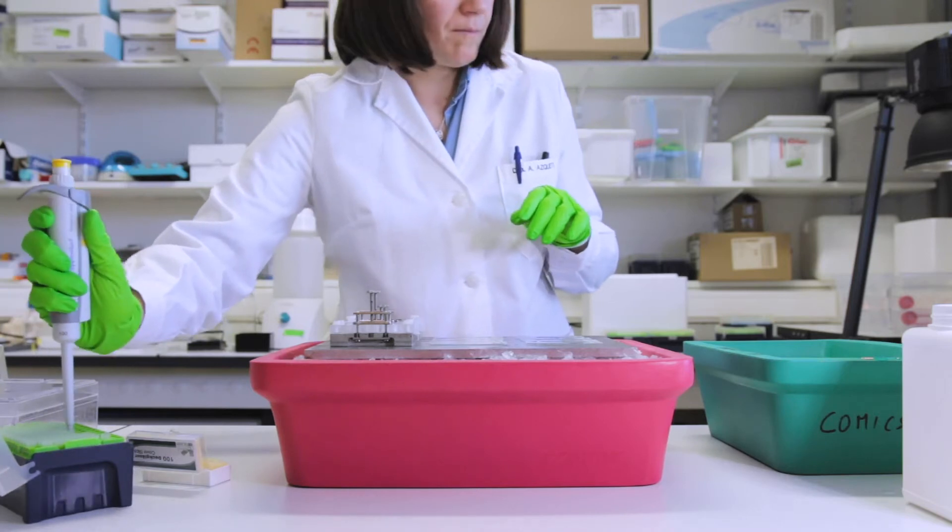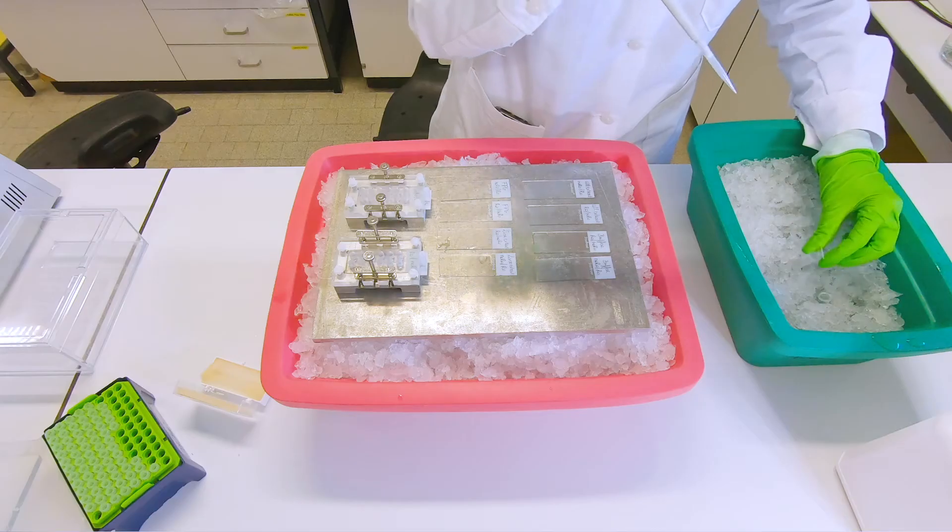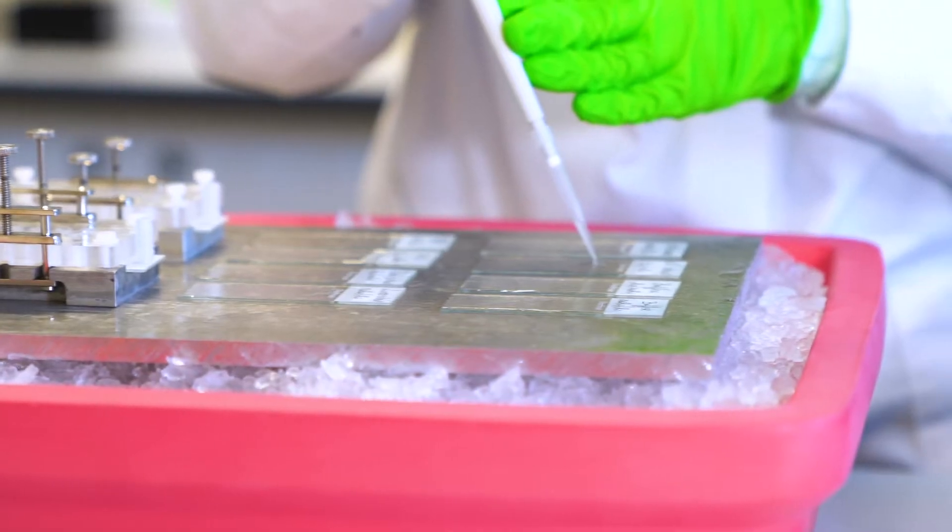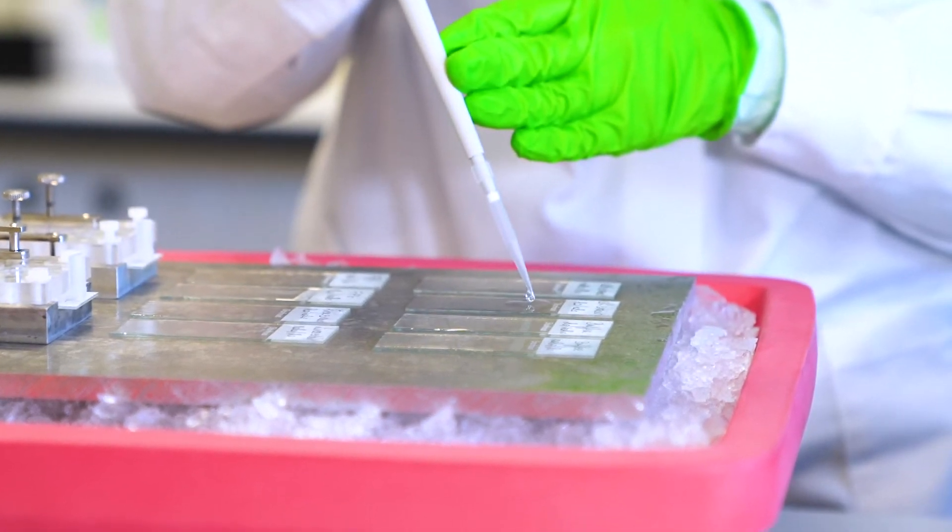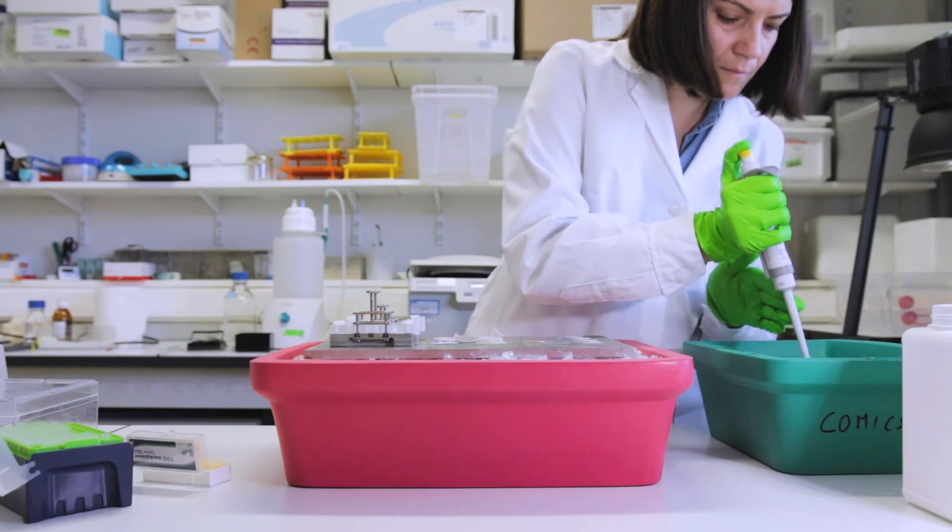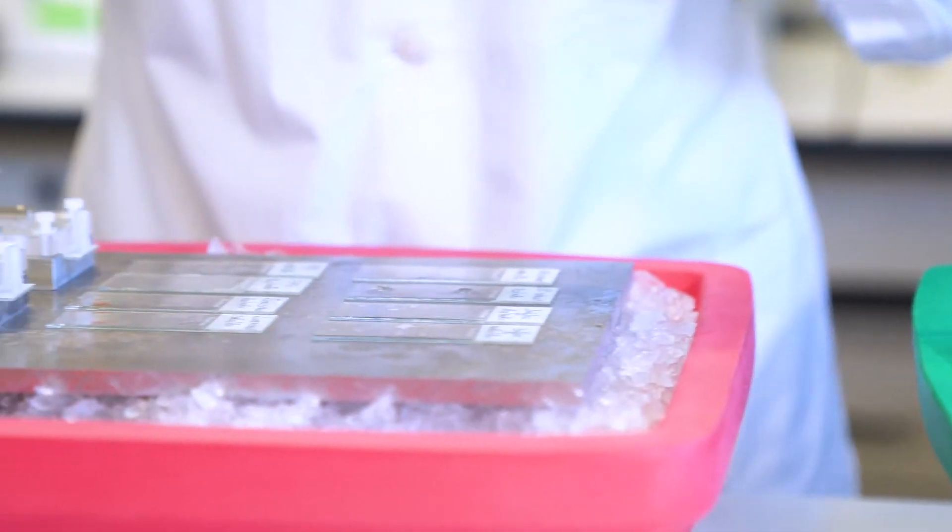So next is the cell extract. Again you take 50 microliters for each of the gels. You can see that we do this by dripping without touching the gels.